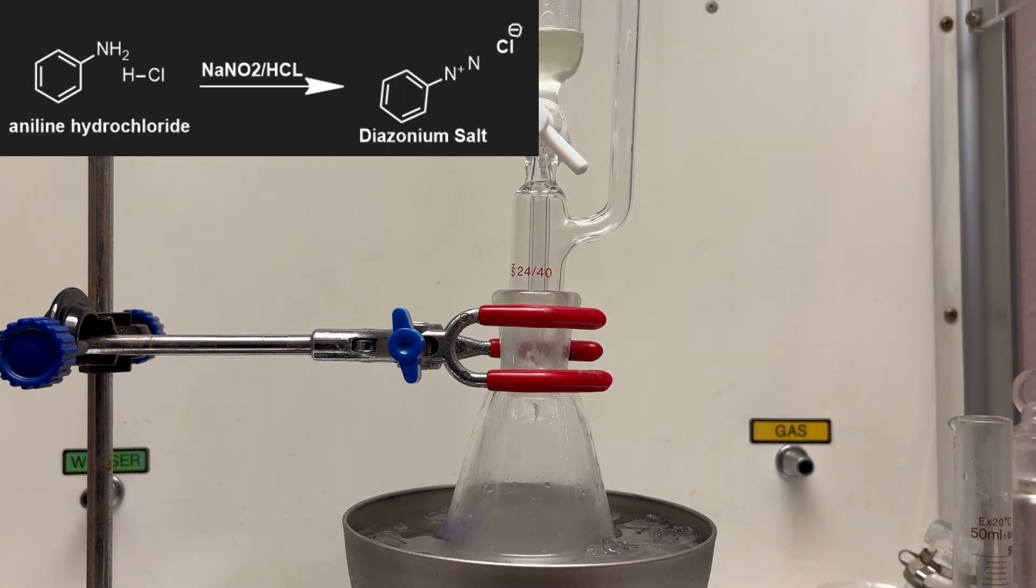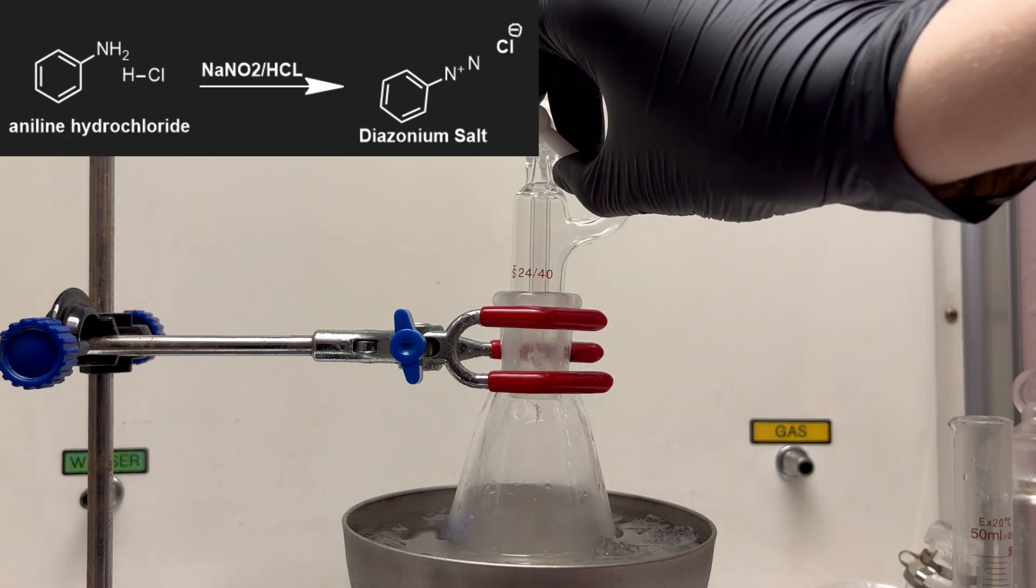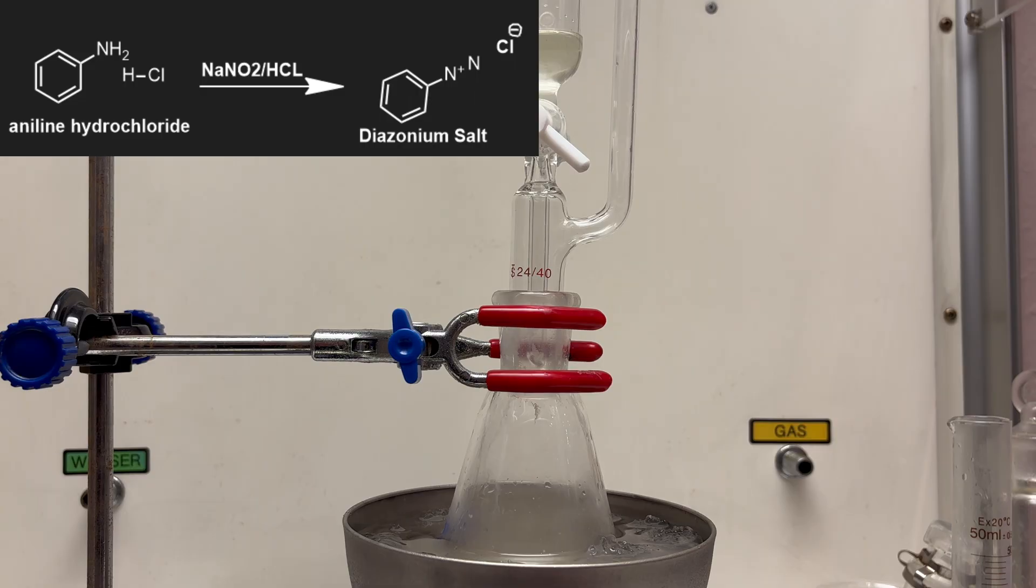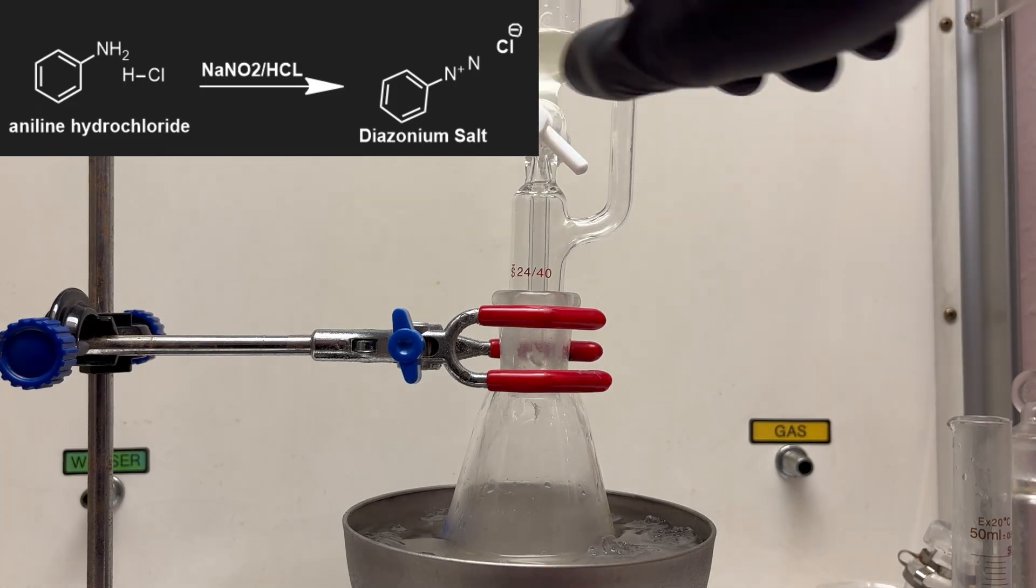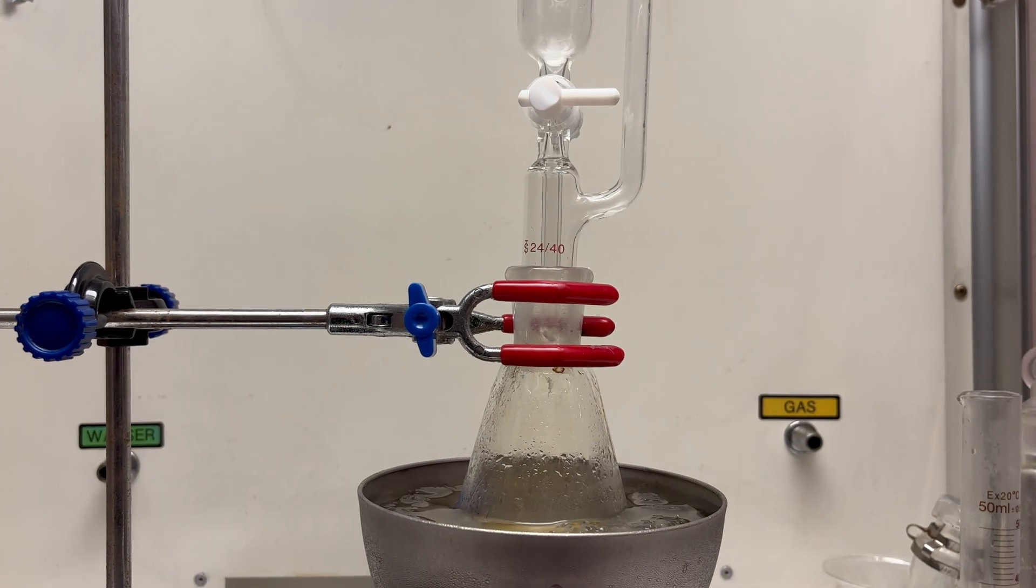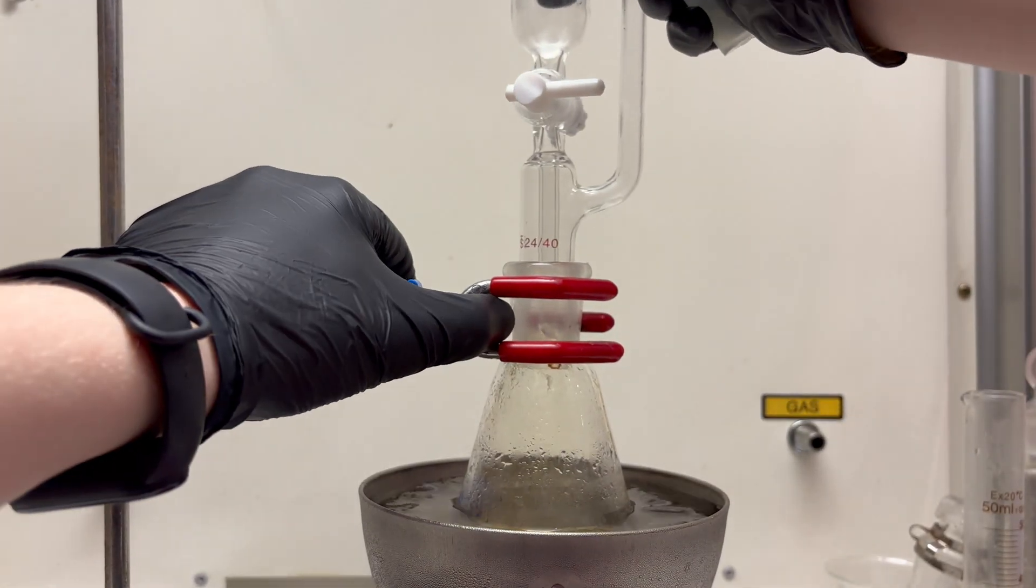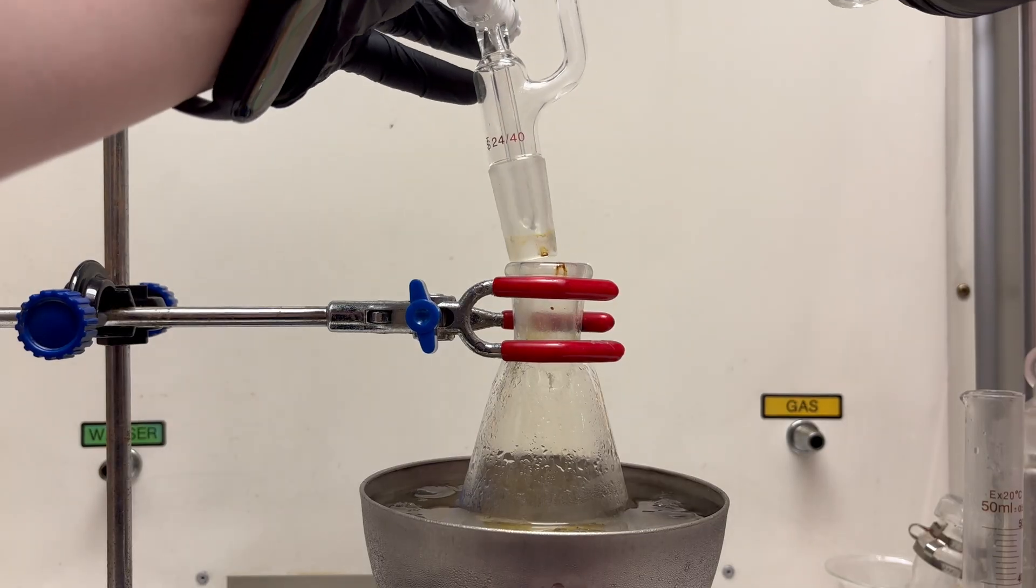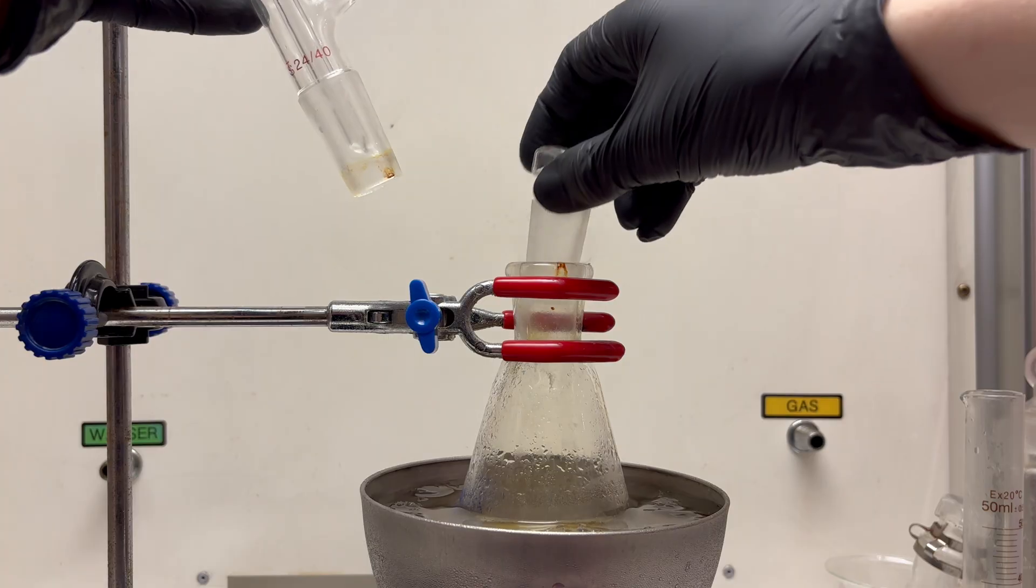When the sodium nitrite solution is added, it reacts with the aniline hydrochloride to produce the diazonium salt of aniline. It's important to keep the reaction between 0 and 5 degrees Celsius because it's very heat sensitive. After the reaction, the addition funnel was removed and the reaction mixture was stirred at 0 degrees for one hour.